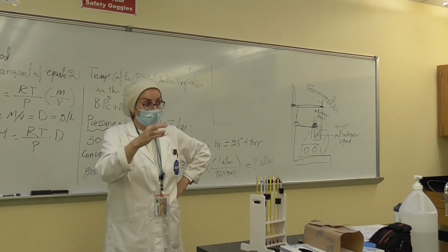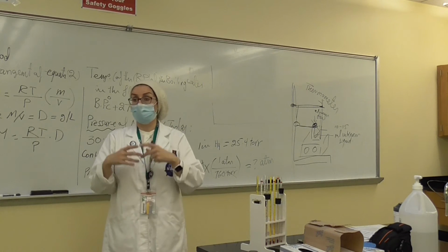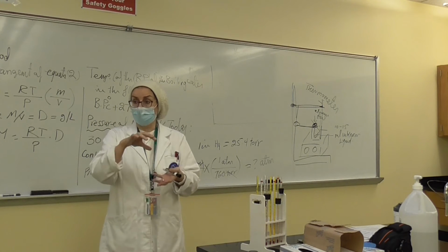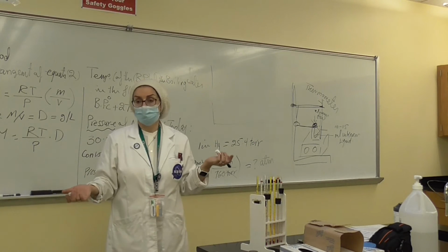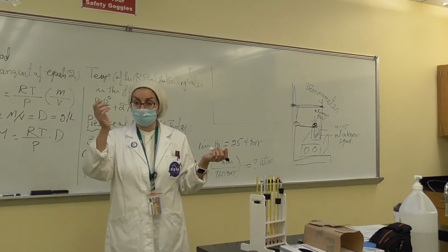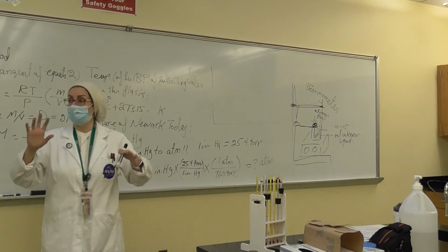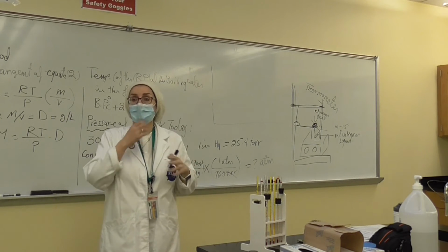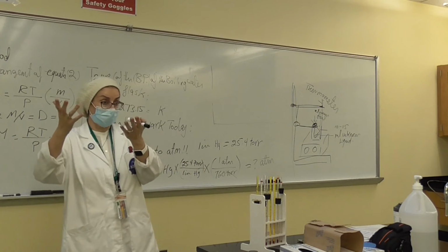And what you have there on the top, in other words, that it is going to take the volume of your Erlenmeyer flask is the gas of your liquid, right? It's gas. It's because it is volatile, so probably around maybe 70 to 80 degrees Celsius, those are going to start converting from liquid to gas.